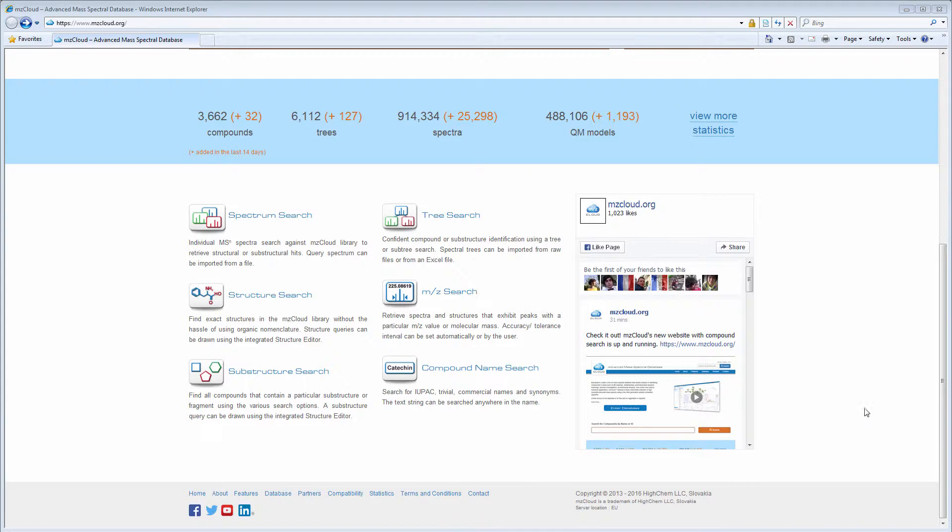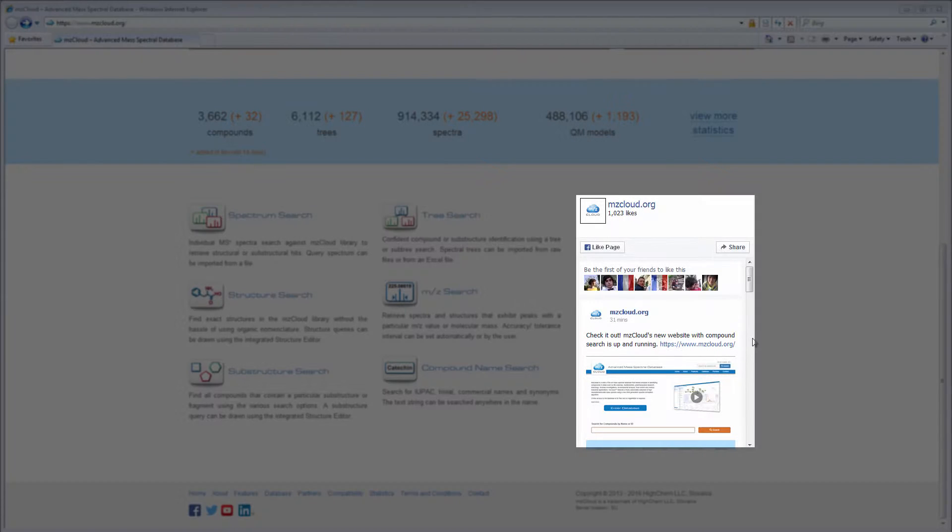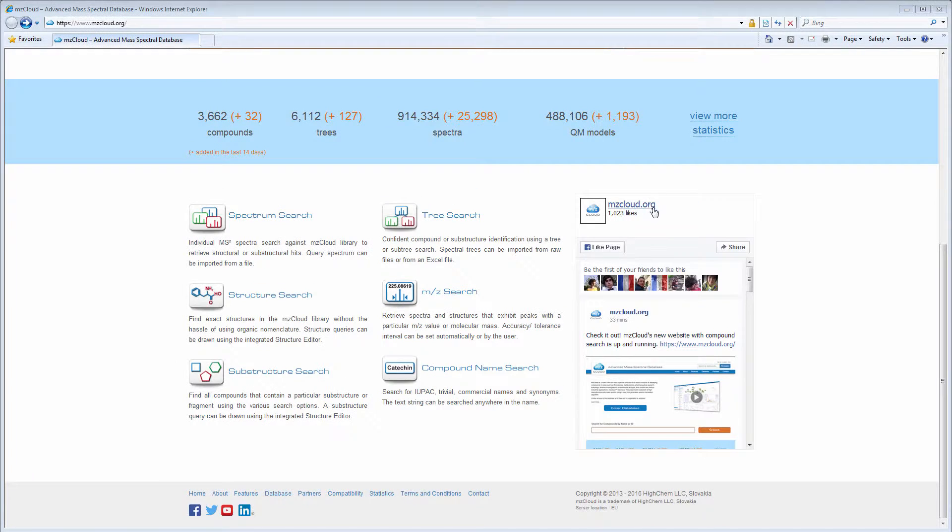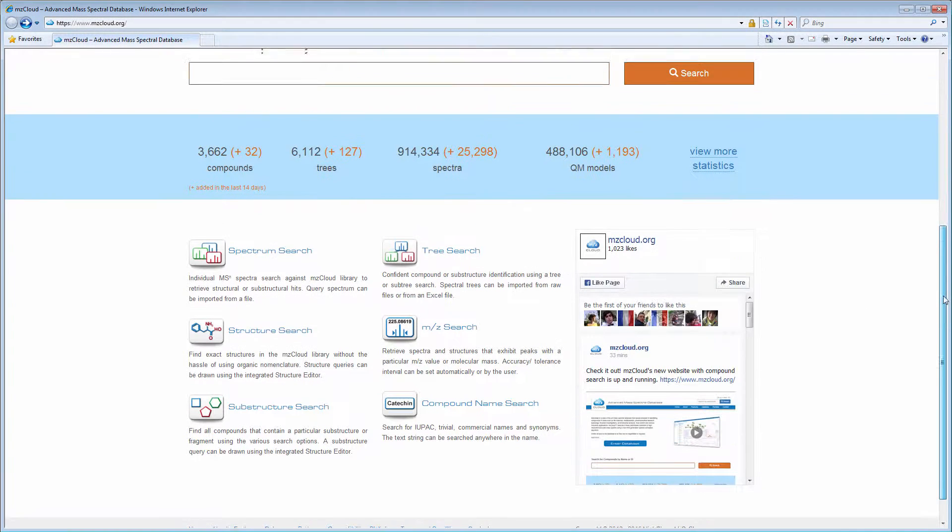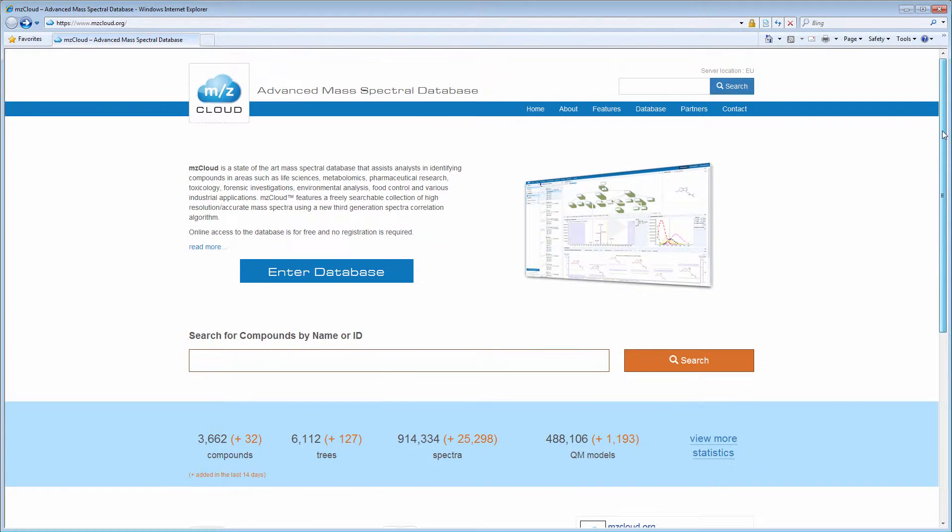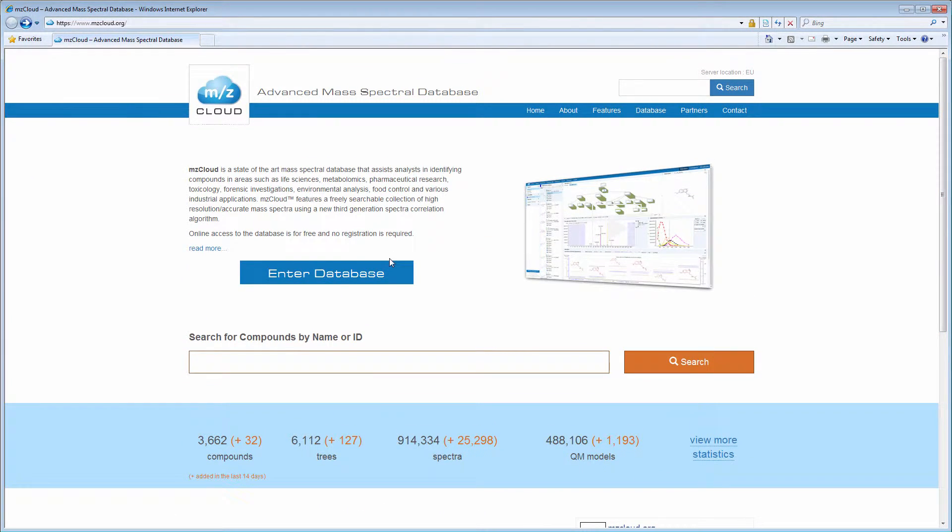If you want to learn about features and updates, check our Facebook feed on the right-hand side of the page. Now we will enter the database.